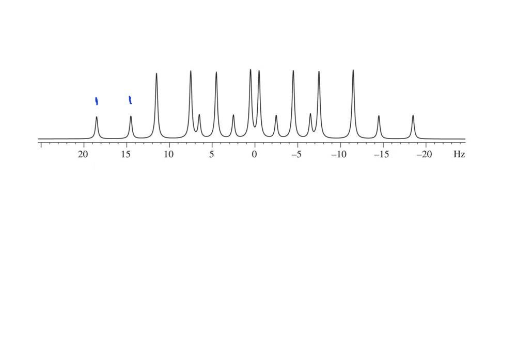Now, for the third peak, you might ask, is this 2 or is it 3? Because it might be difficult to tell by inspection. This is where the ability to check our work with the sum of the integral values will be important. But if we assign these to be 3, and the small ones are 1, 3, 1, 3, and now we're at the midpoint. In an ideal multiplet, this now reflects.